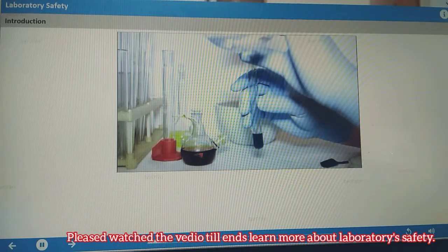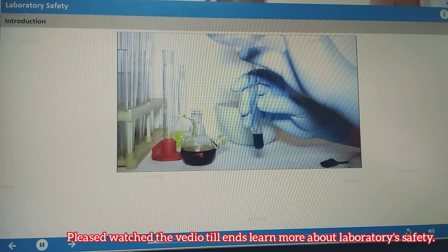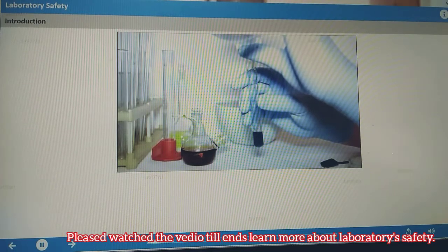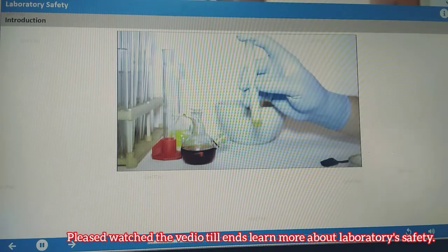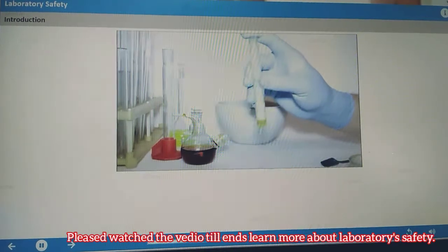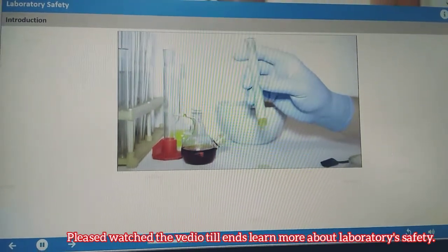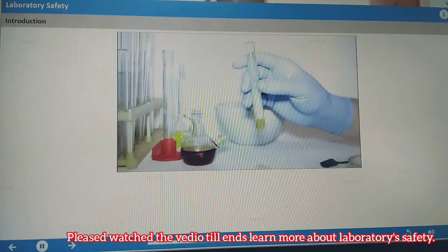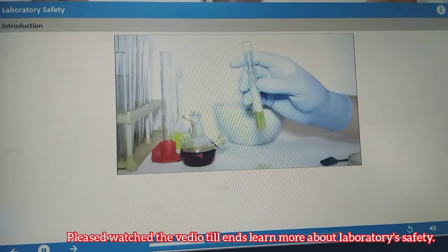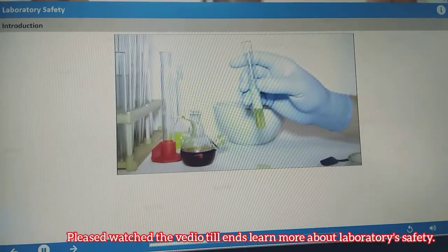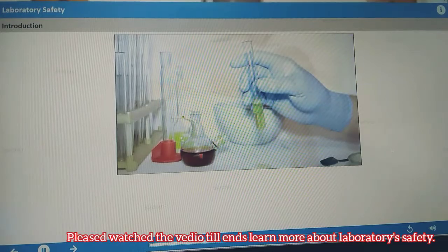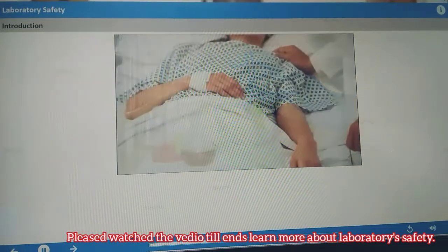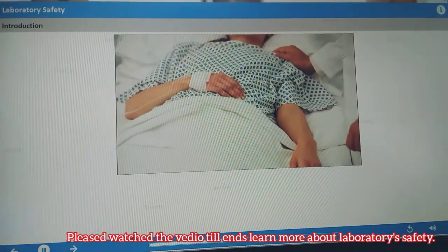A chemist was preparing an experiment that involved the use of dimethyl mercury. The professor spilled a few drops of the compound on her gloved hand, but thought the latex gloves would be protective. They proved to be inadequate, and the toxin passed through the glove and was absorbed into her system. Six months later, she slipped into a coma and died from acute mercury poisoning.